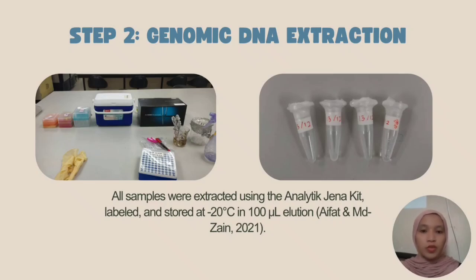All the samples were extracted using the Analytik Jena kit and then labeled and stored at negative 20 degrees Celsius in a final elution of 100 microliters.